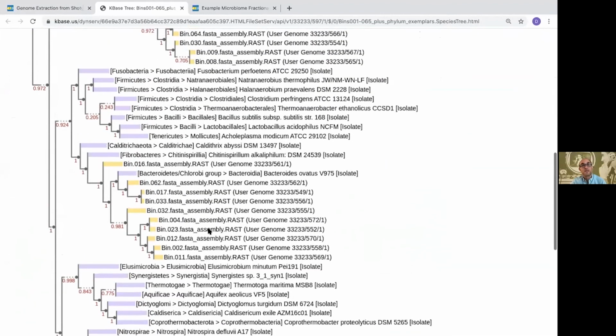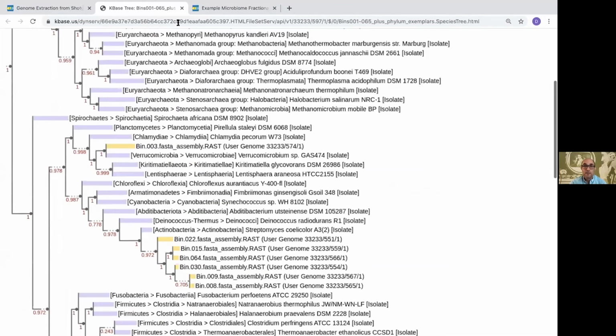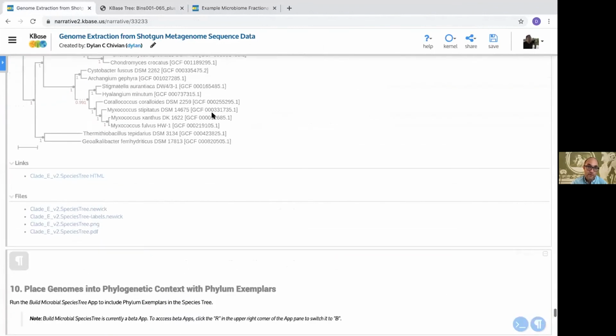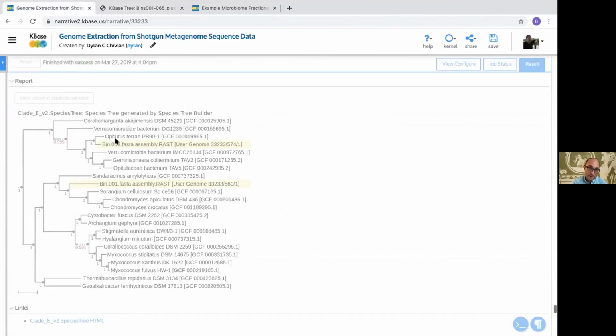So there's sort of this balance we want to achieve of the high-level global view of phylogenetic placement, and then the more high-resolution, zoomed-in view that you get from the truly proximal RefSeqs, right?